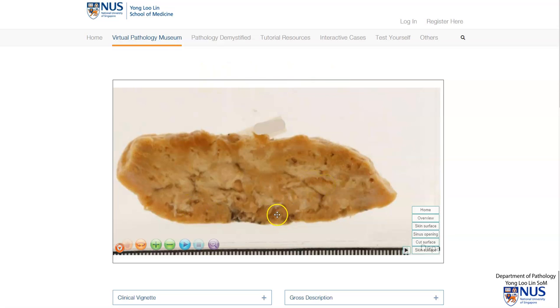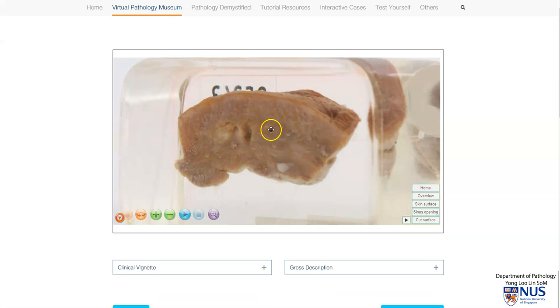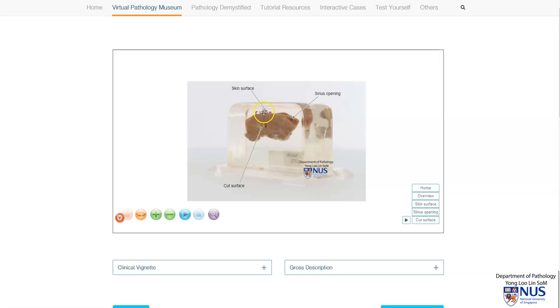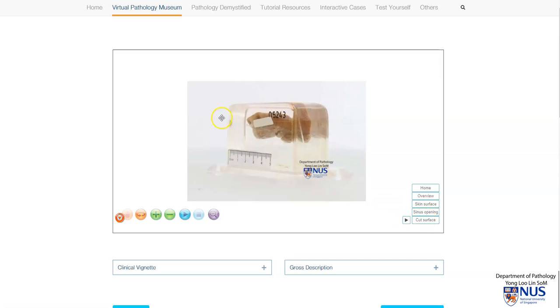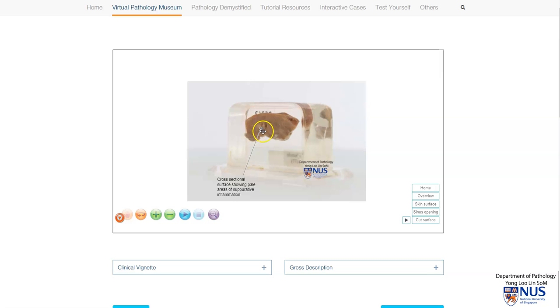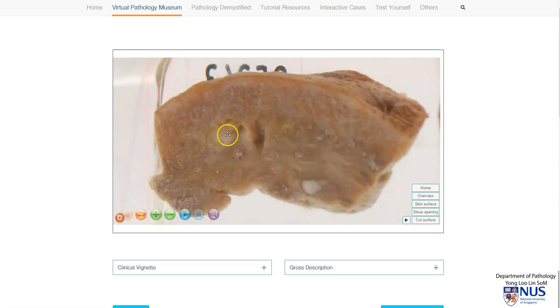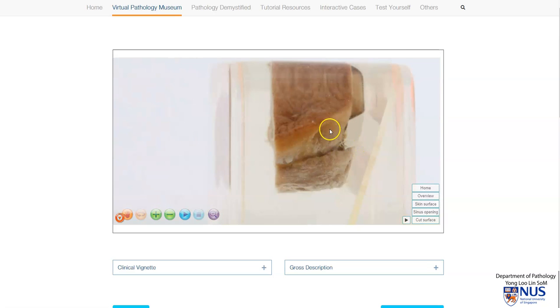Let's look at another example of a carbuncle. We have the skin surface on top, a sinus opening here, and the cut surface in this region. There is suppurative inflammation. In this area we can see the yellowish pus. We can also see abscess cavities, and just here there is a small dimple caused by the sinus opening.